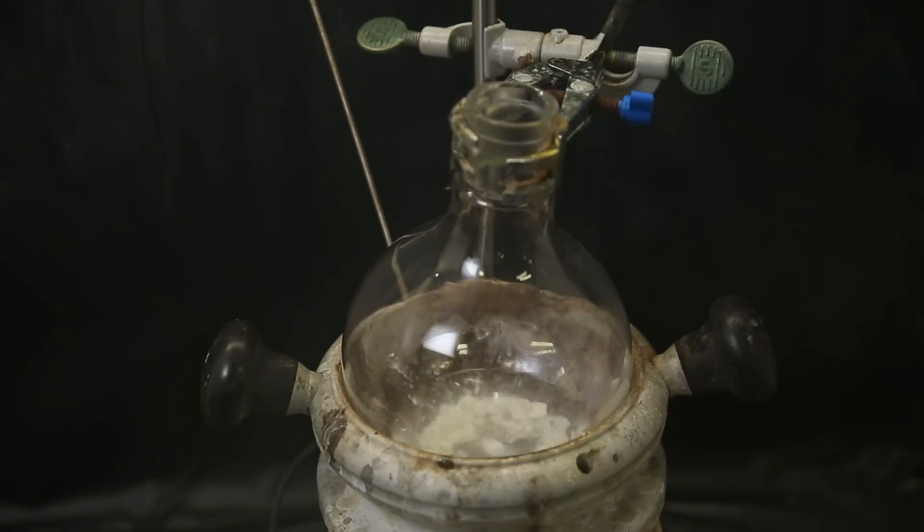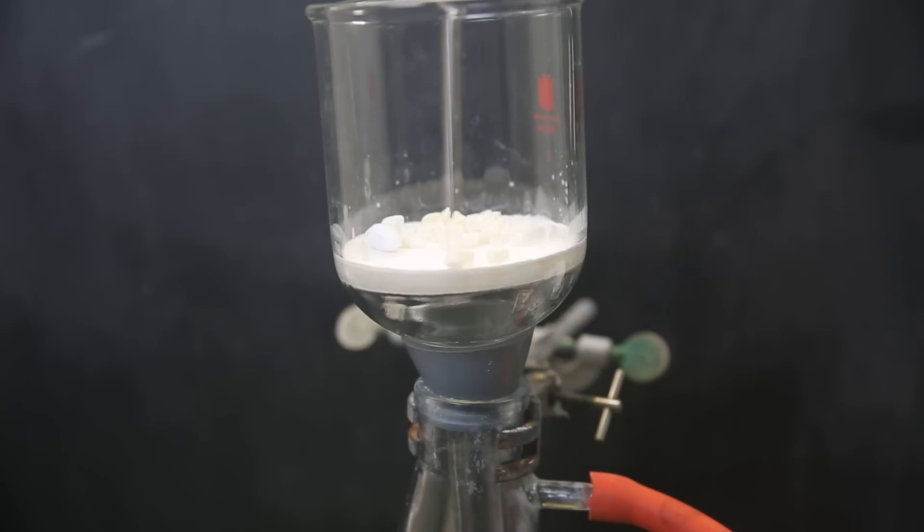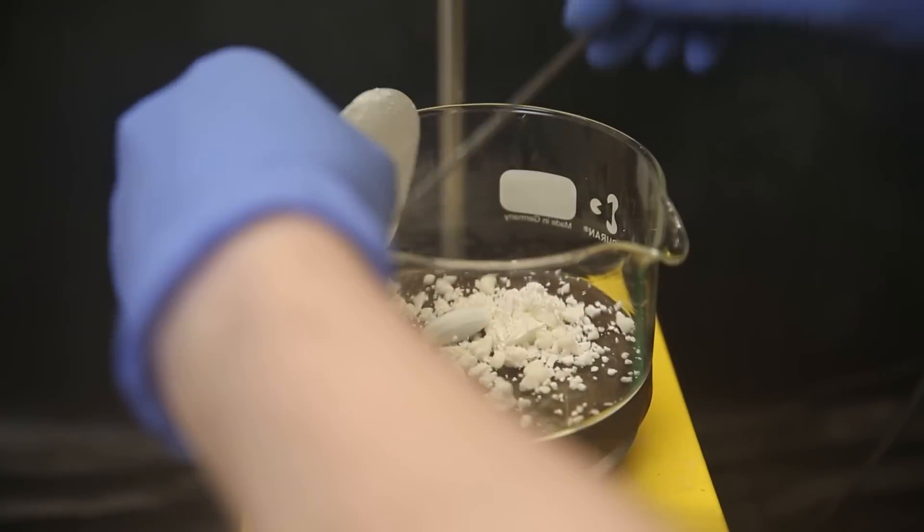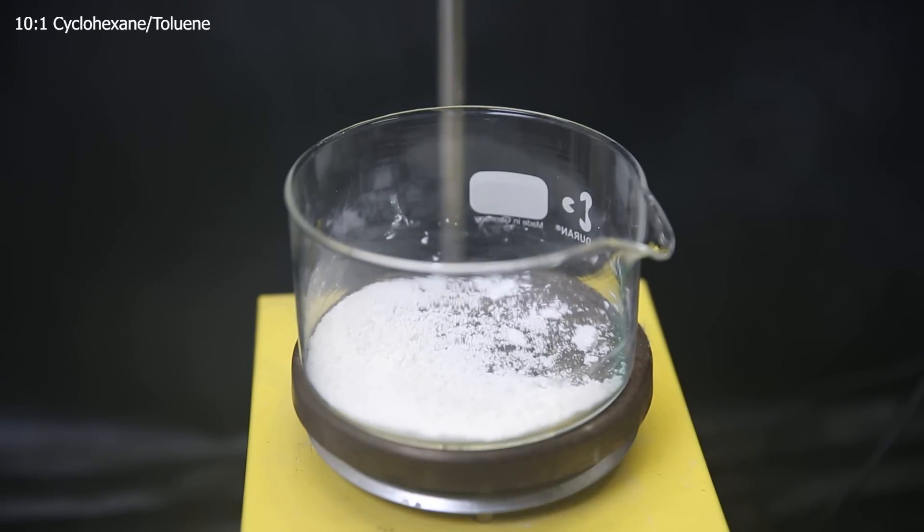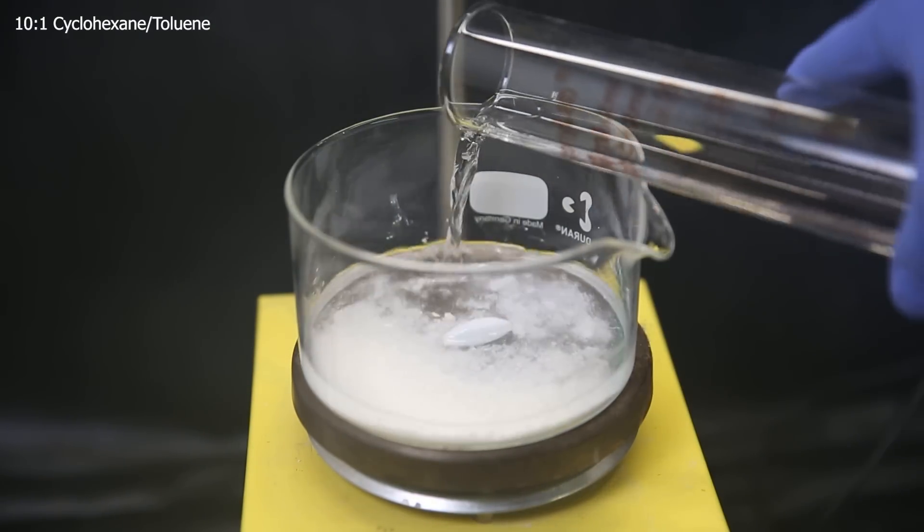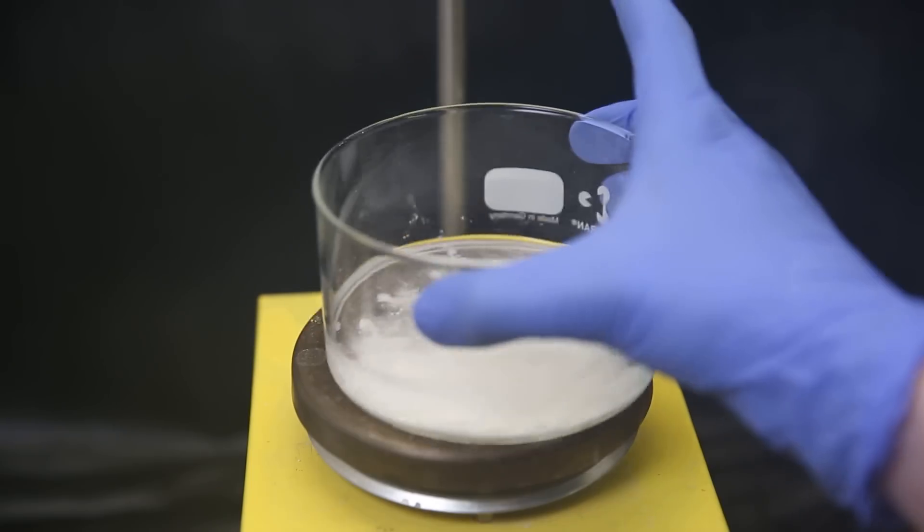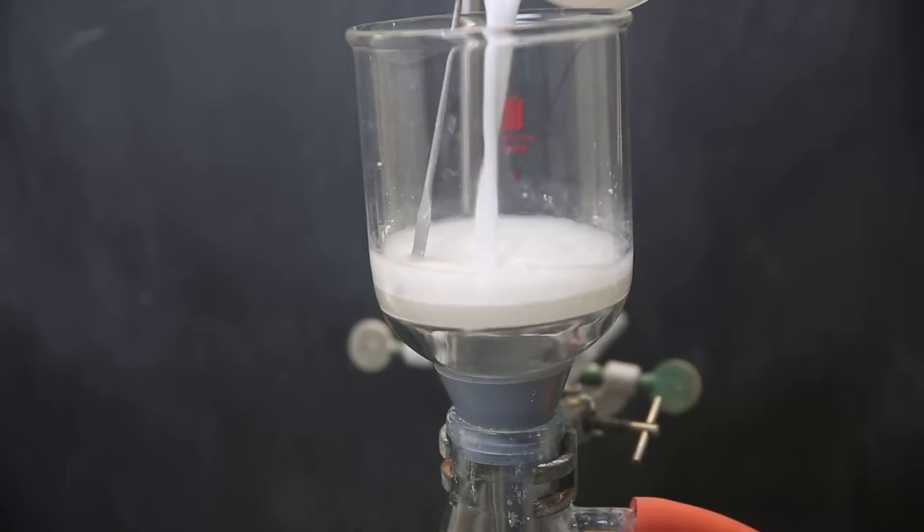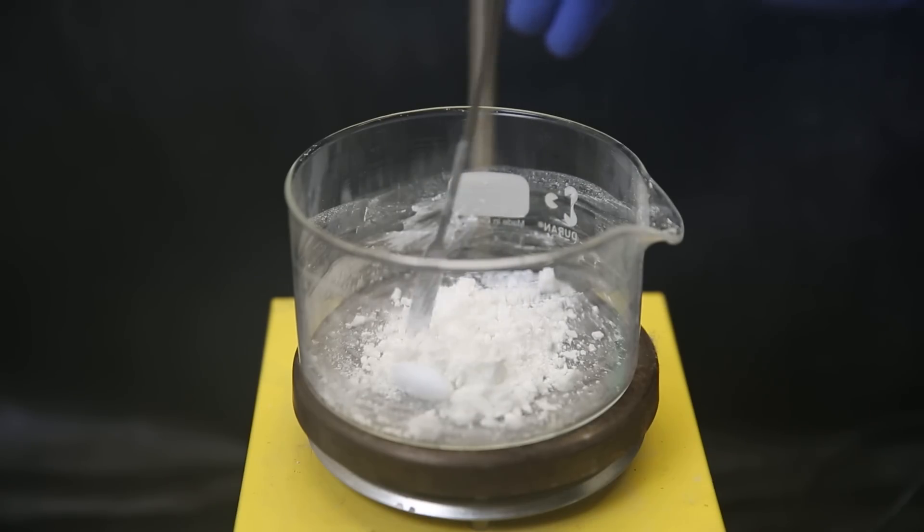I leave that to stir overnight, and afterward it became a lot more white. I set it up for vacuum filtration to collect the solid and then move it to this dish. Since the solid contains some rock-hard chunks, I decided to crush them into a powder with a pestle and redo the washing with the cyclohexane toluene mixture. This step also improves the optical purity of the product, but I don't have a way to measure it. Either way, both enantiomers are active, the S just more than the R. After letting it stir overnight, I again filter out the solid and just move it to the same dish, giving the product as a white powder.